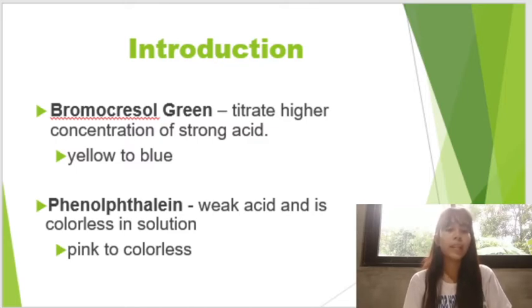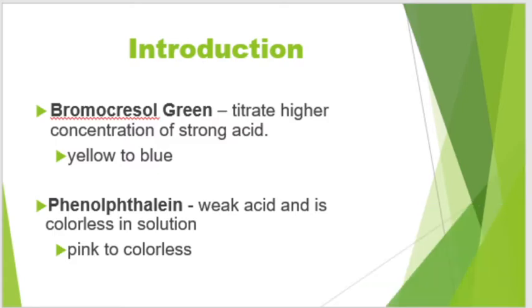Bromocresol green titrates a higher concentration of strong acid and turns color from yellow to blue, while phenolphthalein is a weak acid and colorless in the solution. The goal of this experiment was to know the components and to determine the composition of an unknown carbonate mixture.